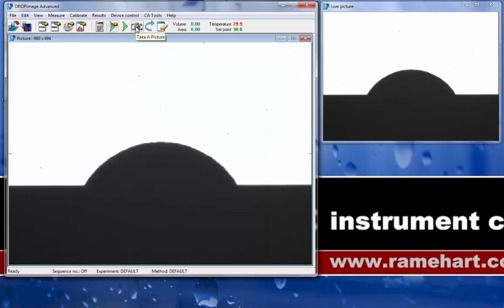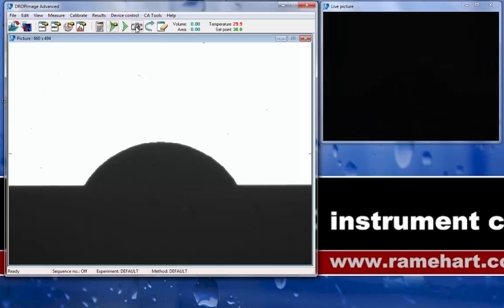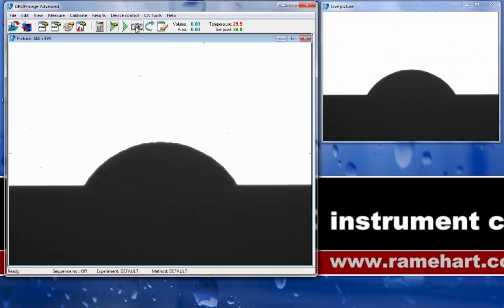This takes a picture from the camera from the live video and transfers it to the static image window. Note that when we take measurements, even when we do so quickly, we are taking measurements on a per-frame basis, not on live video.